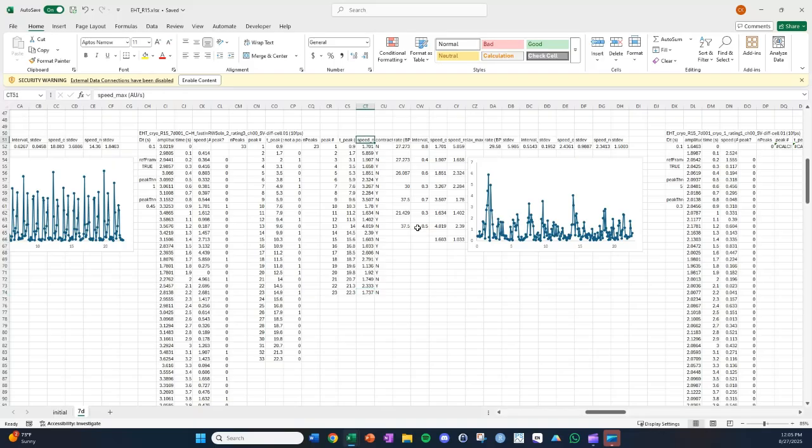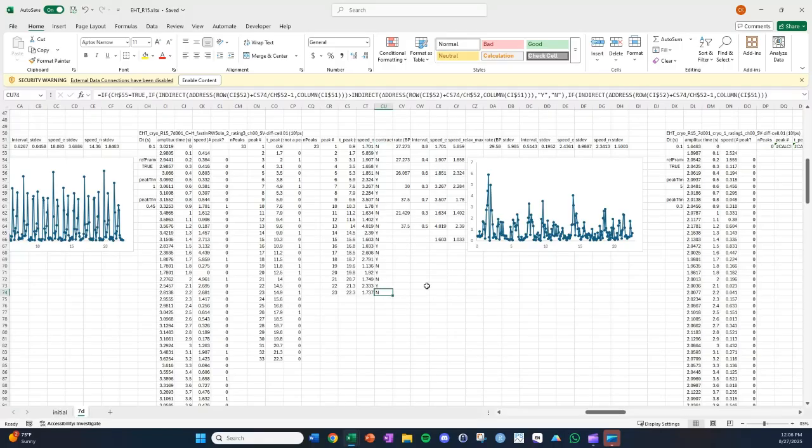Definitely, you might want to go through and make sure there isn't anything below like 1. So there isn't anything below 1 here. And some of these peaks that are below 2 are kind of necessary in order for the beats to make sense. One approach you could do that I don't typically do is look at the videos and try to map that onto what you're seeing here. One issue of that is that it can be quite hard to see, like this is indeed faint beating, but that's definitely an approach you could use.